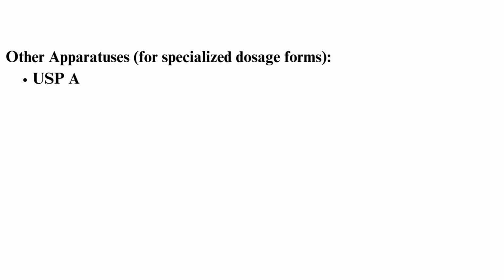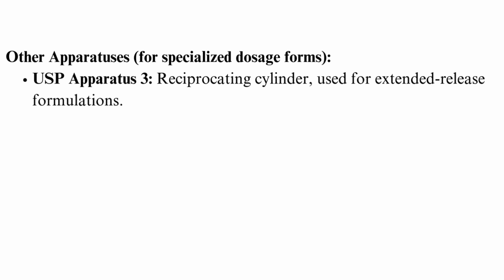Other apparatuses for specialized dosage forms. USP Apparatus 3, Reciprocating Cylinder, used for extended release formulations.